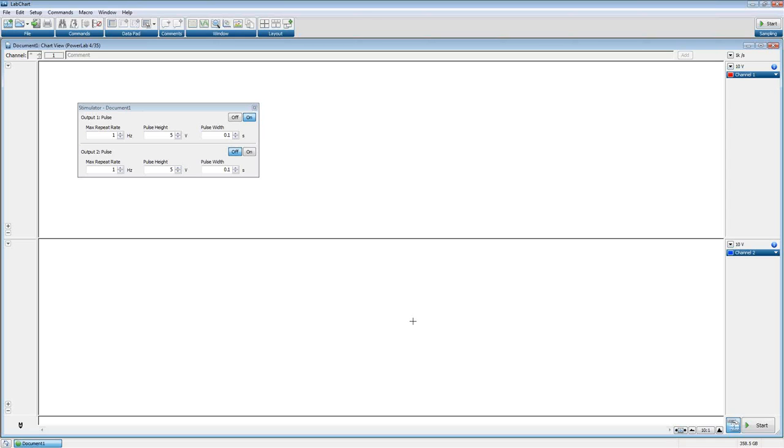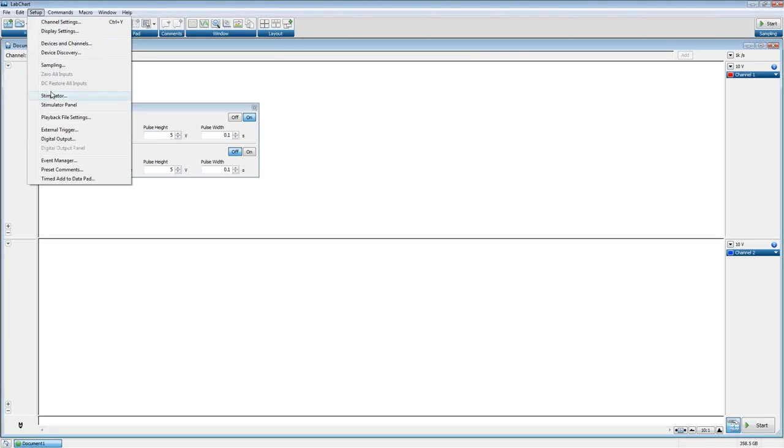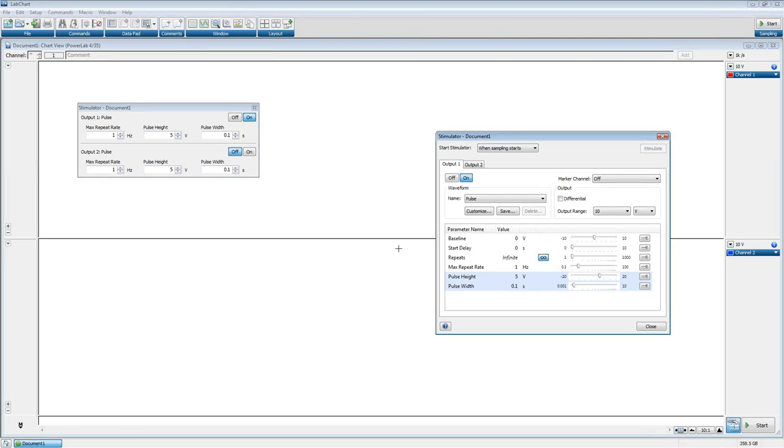If you want to change specific things in your stimulus, you can do that here very easily. It's only what you really need to see whenever you're actually doing your experiment, instead of all the other parameters that are kind of cluttering up the view and might distract or confuse you while you're in the heat of the experiment.